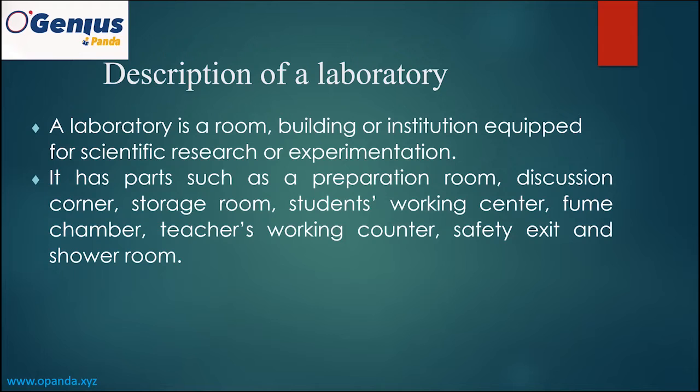Sometimes we may produce harmful fumes, so those types of reactions should be carried out in a fume chamber. There is also a teacher's working counter, where the teacher can stand to show demonstrations to the students. It also has a safety exit in case of an emergency, and a shower room, depending on what you've been carrying out as the experiment.